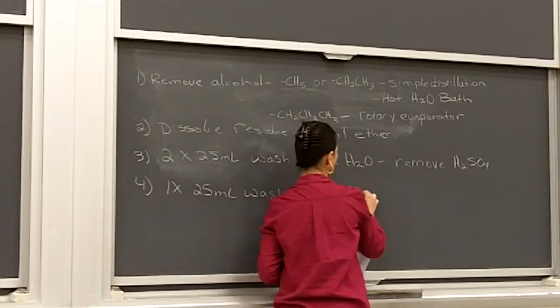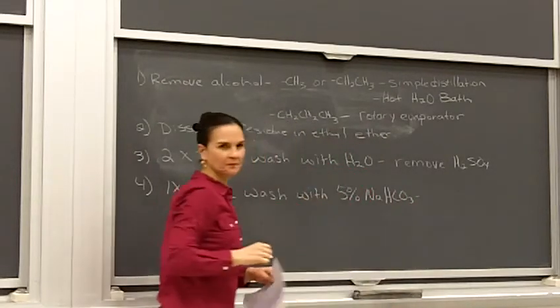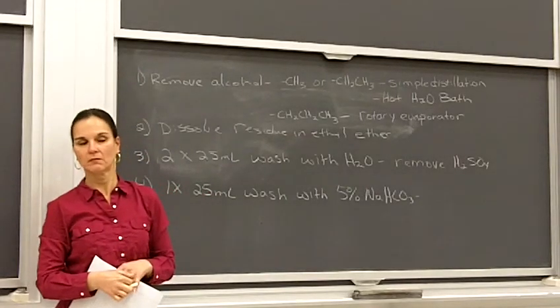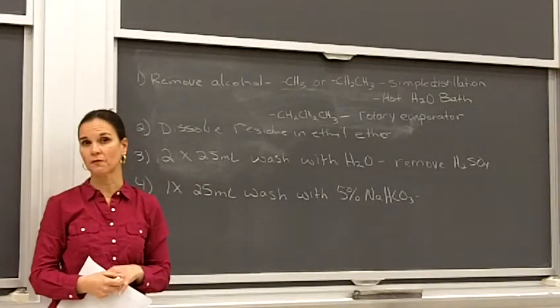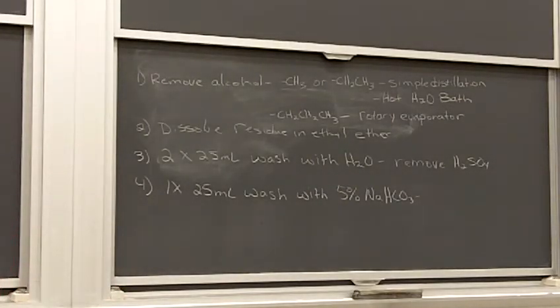with 5% sodium bicarbonate. What will that do? Why do we need to do something basic? It will help us remove any residual sulfuric. Okay. What else will it help us remove? Think about what we're starting with. Okay. Will sodium bicarbonate help us deprotonate this proton? Yes, right? And get it into solution so that we can remove any remaining starting material.